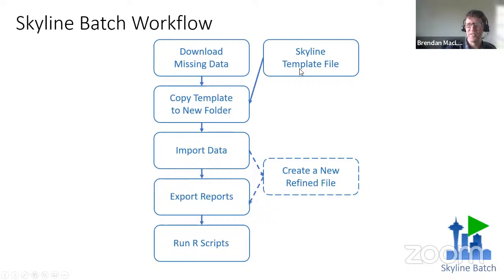So we never alter the template file. We make a copy of it and then continue from there, which makes it possible to do 10 different variants on the same template to see how you get the best processing.